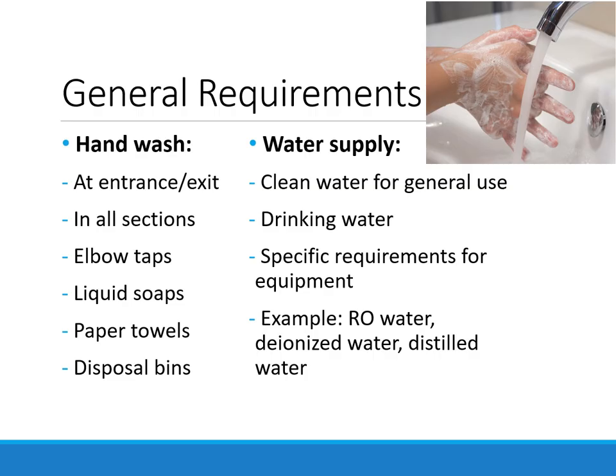The general infrastructural requirements of a laboratory begin with hand wash facilities. These must be available at the entrance and exit and in all individual sections. They must be fitted with elbow-operated taps, liquid soap, paper towels, and disposal bins for the paper towels at each hand wash sink.